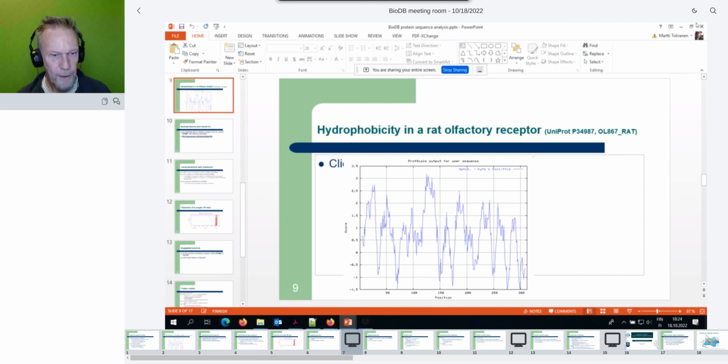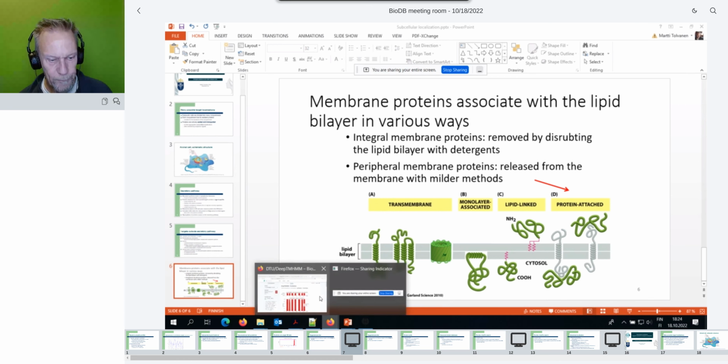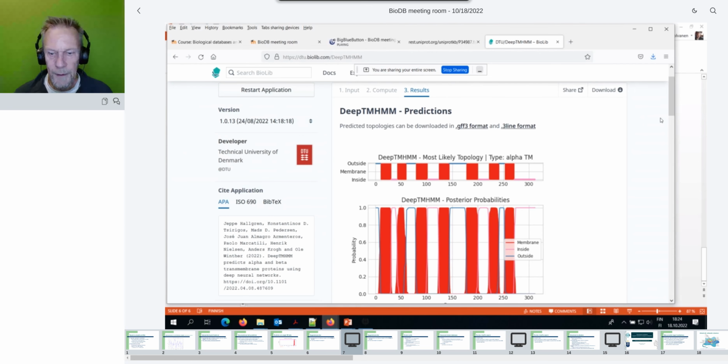But still, this is way more certain. We don't have to be second-guessing whether a narrow peak would actually be a real signal or not, or whether a split peak, which shows as two different ones, is two peaks or one or no peak at all.